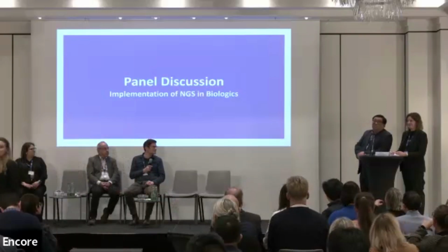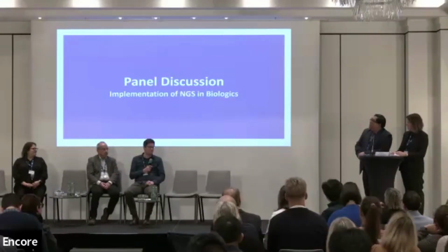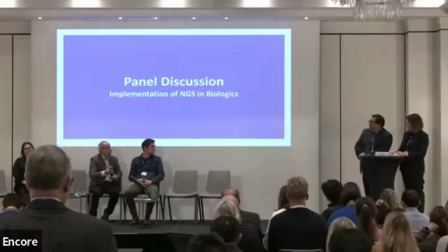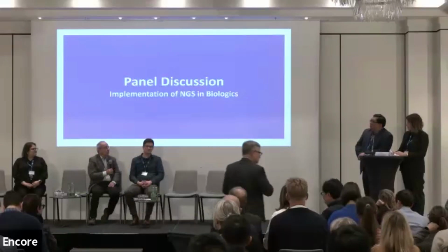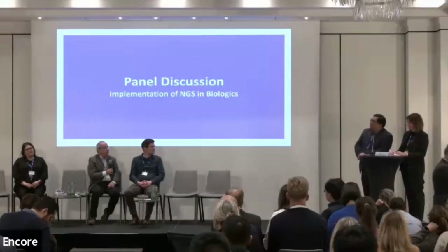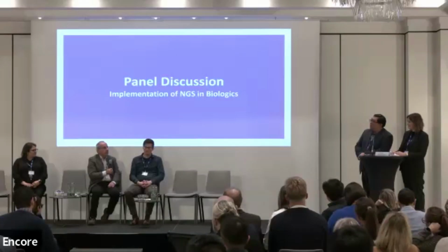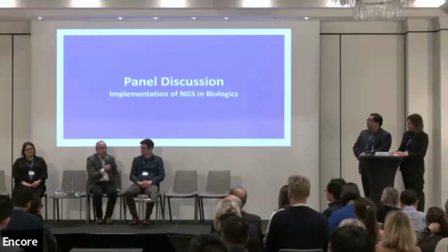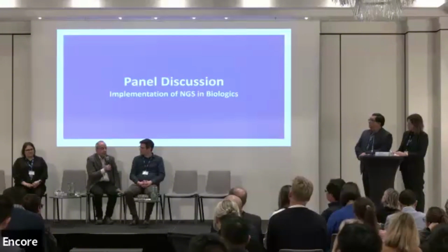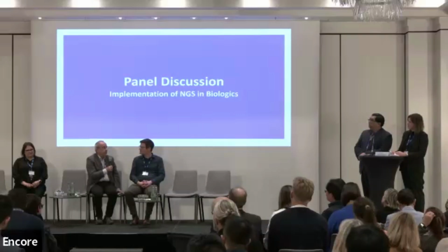Actually, I have a list of questions. I just didn't want to stand between coffee and you. But maybe for Robert, I'm curious about the bacterial identification. Is that thinking of replacing some of the current tests or more as a follow-up? Also, mycoplasma is a good way of where that would enter the space, because that's a long assay as well. Yeah, some tests are too long, and also things like mycoplasma can have nucleic acid-based detection, but if they're too specific, you could miss some species of mycoplasma. So high throughput sequencing solves that.